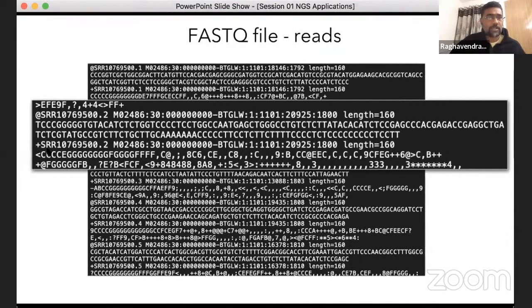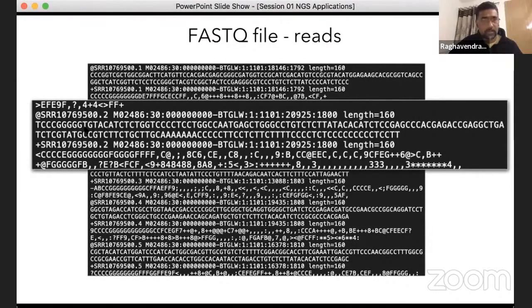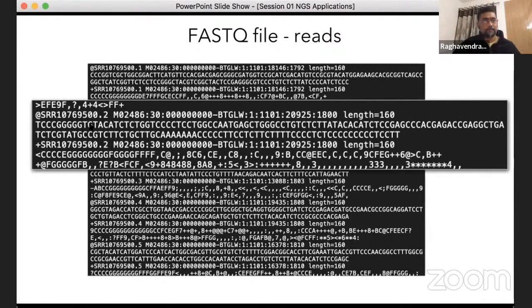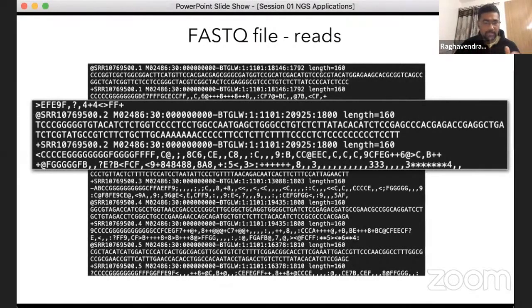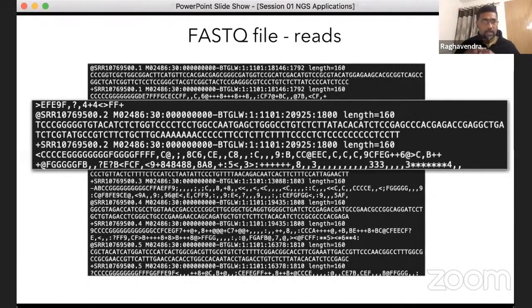After the separator, we get quality scores associated with each base call in ASCII format. Each character tells us how confident the sequencing technology is about the placement or the call of that particular base at that specific position. This quality information is used throughout downstream analysis — first to filter reads of low quality, and then even at the end to associate confidence with identified variants based on the quality score they are called with.